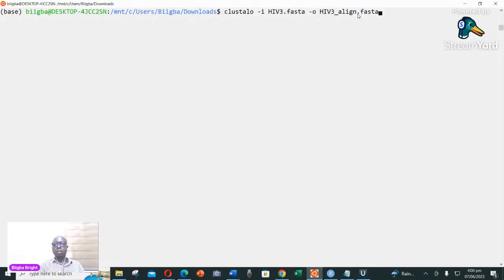Depending on whatever you want, you might not want anything else, so you can leave it here. If you want anything else, the next thing is to do full alignment. The full alignment is when you use --full, and the output will be in matrix form. That way you may not have your guide tree. If you want to do clustering, you need to generate a guide tree using this particular code. The code will be like the same input, but here you use a guide tree, so that you generate the alignment in the form of a guide tree. I gave it the name H tree, but the extension might be NWK, that is Newick.